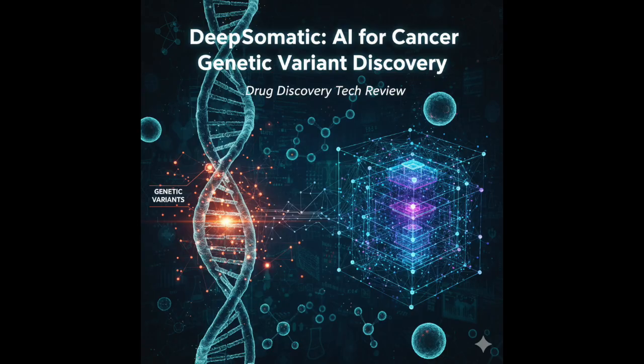Based on the patterns in the pileup image tensor, the CNN outputs a classification for that candidate site. It decides: is this likely just the reference sequence, maybe with some sequencing noise? Is it a germline variant, inherited, present in the normal sample too? Or the crucial one, is it a true acquired cancer-associated somatic variant? And because it's learned from those complex images, it can make that call even with low VAFs or tricky artifact patterns. That's the whole point.